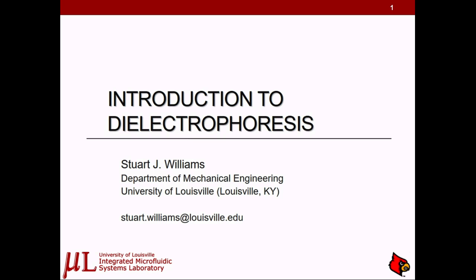And after doing research, looking at these various techniques, I thought dielectrophoresis may fit the bill. So ultimately, we have had an electrode configuration where this dielectrophoretic force is applied such that it would trap a particle and keep it suspended in the center of the channel. I'll show some preliminary results later from the study, but that's how I got into this, trying to figure out how we can trap a particle.